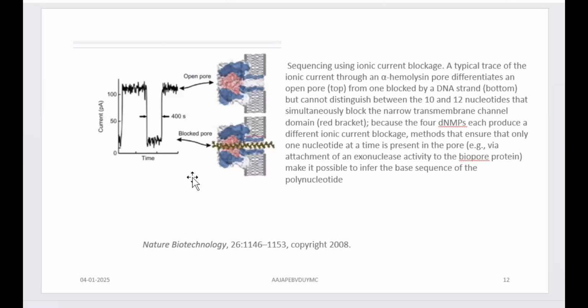So graphene is used on silicon chips, and electron beam drilling is used to create nanopores. Can you just imagine these words: graphene membrane, on that you have silicon chips, and electron beam drilling is used to create nanopores. The size of the nanopore is 3.3 nanometer. So single stranded DNA and double stranded DNA can easily pass through it.